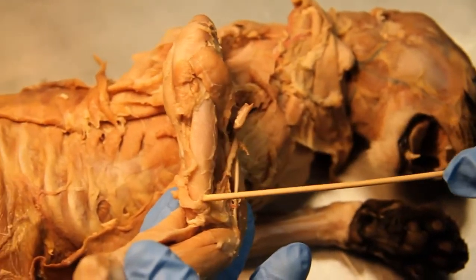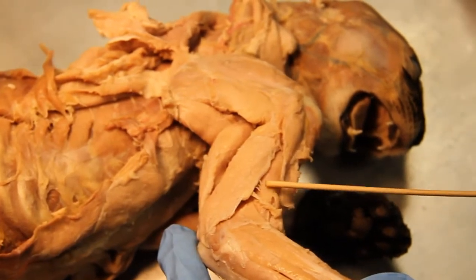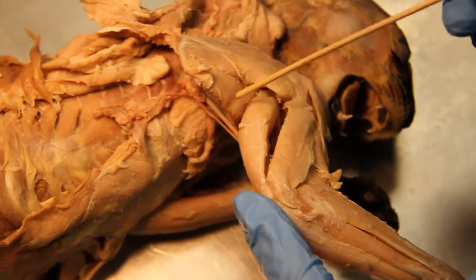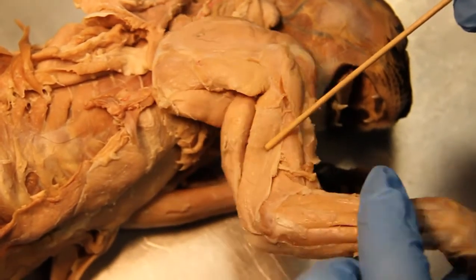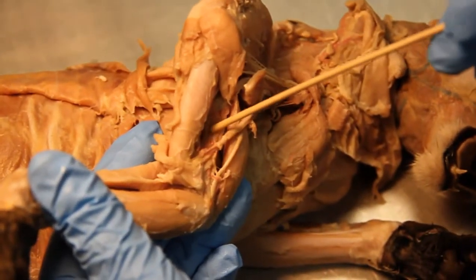Biceps brachii. The brachialis. The long head of the triceps. Lateral head of the triceps. The medial head of the triceps.